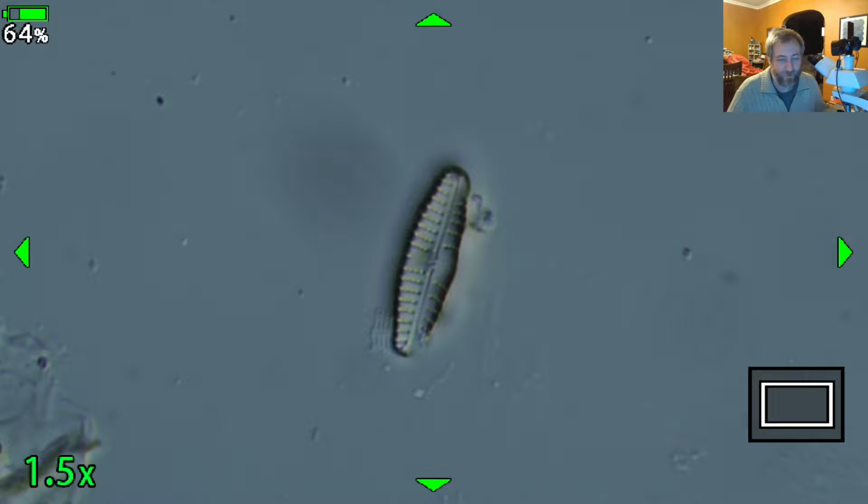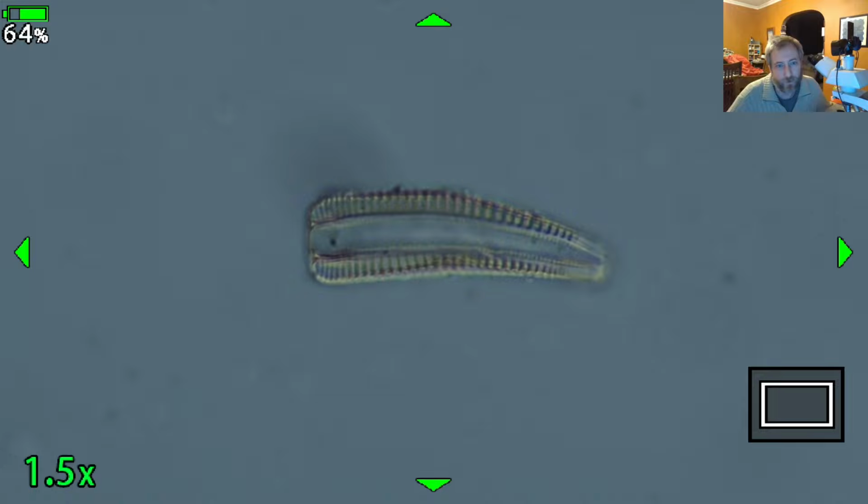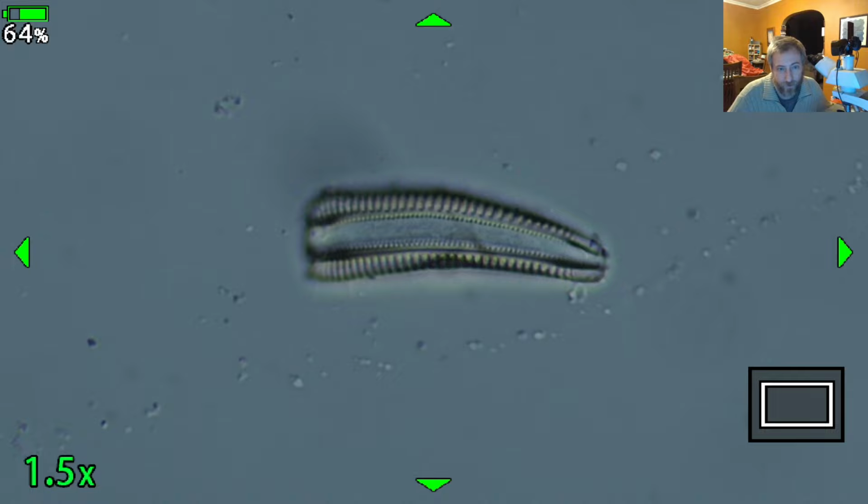Okay, so that's a cool diatom to see in the sample. There's another diatom that's a flowing water indicator. It's this one. This diatom's in girdle view. In other words, we're seeing it from the side. So we can see both valves, and we can also see the girdle bands. The lines that you see at the top and the bottom are striae, but instead of seeing a raphe running through the middle of the valve along the axis, we actually see this open hyaline band with little dots on the bottom and little dots on the top that line it, and that's actually the girdle band. So you have two valves that are held together like a box, like a hat box.